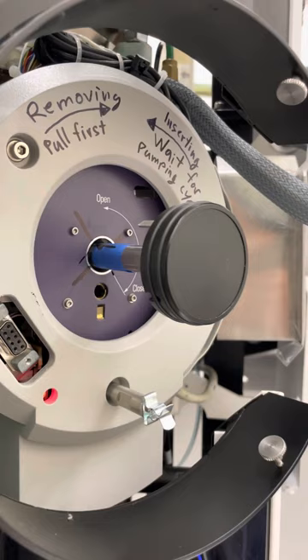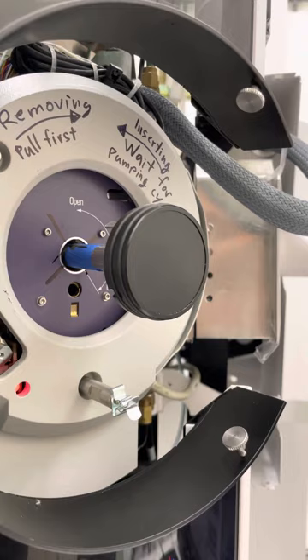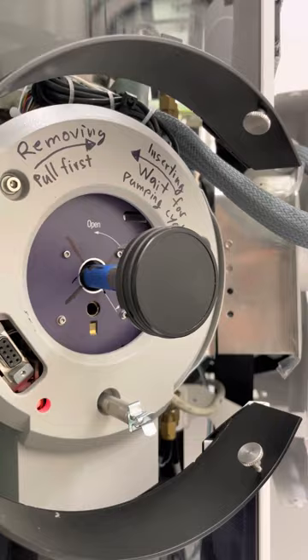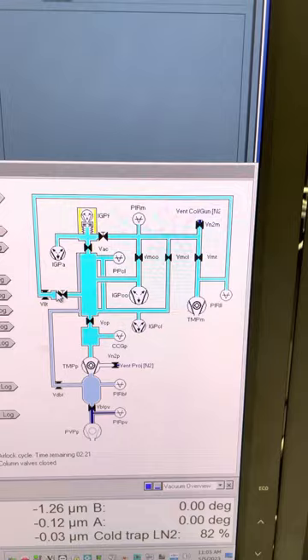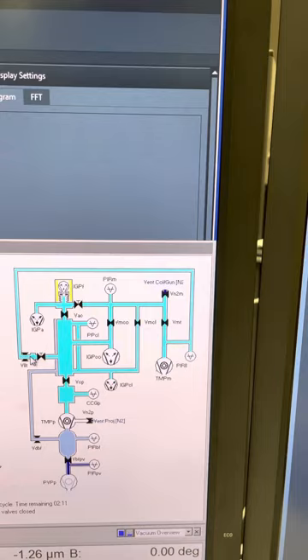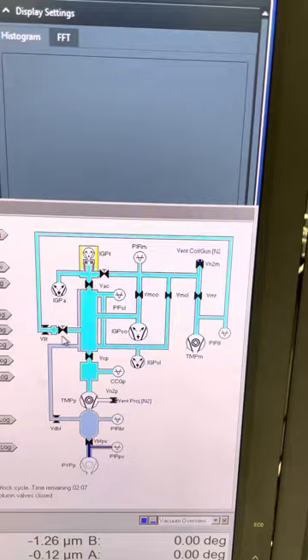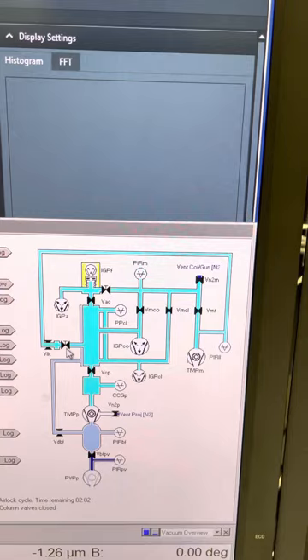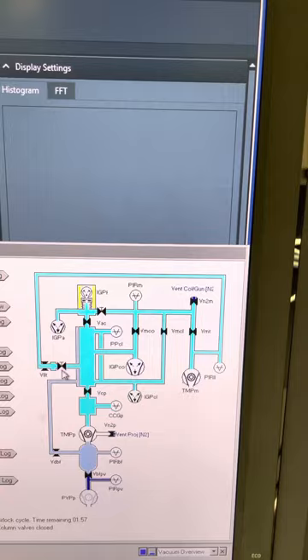When that happens, don't push the holder, just guide it through. What pulls the holder into the microscope is the pressure difference. The column is in ultra high vacuum. In this diagram, the holder now is within this area, and the turbo molecular pump is pumping down the line, which is pumping down the airlock. This is the only mechanical valve which is controlled. The holder itself opens and closes that valve.